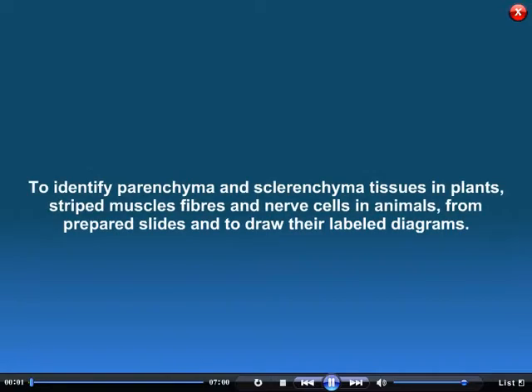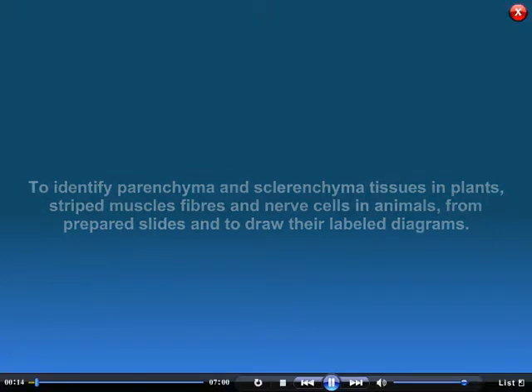To identify parenchyma and sclerenchyma tissues in plants, striped muscles, fibres and nerve cells in animals from prepared slides and to draw their labelled diagrams.